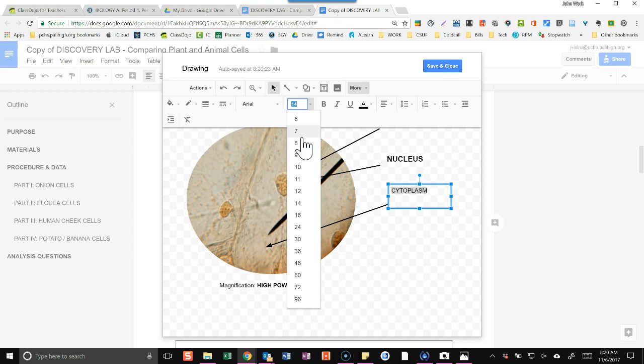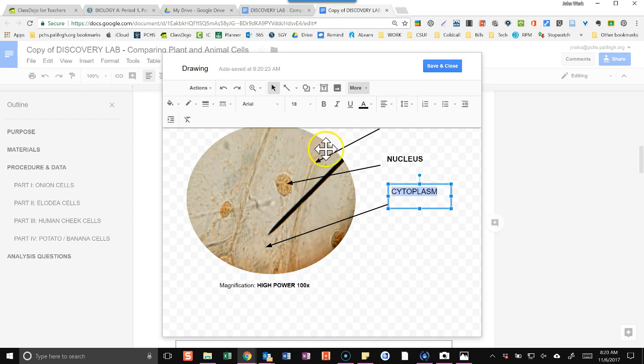And the nucleus is another bubble that's in the middle of that cytoplasm. And inside of the nucleus is where all your DNA is. And that's why the blue stuff will stain your DNA.